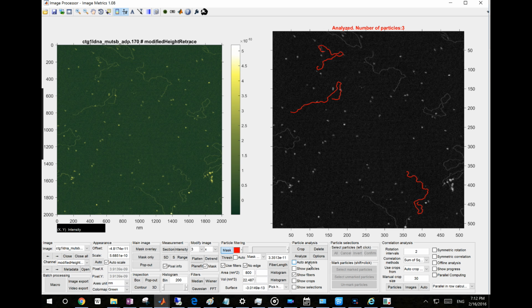When you click auto analysis, you can directly drag the thresholding bar, and it gives you the results as you drag the bar. So it automatically analyzes and gives you the results. And of course the fiber length color bar and the color categorizing still remain as we set. So the green one will be the small fragment, and the red one will be the long fragment. This will persist, so you can continue to decrease this. This is why it's useful.